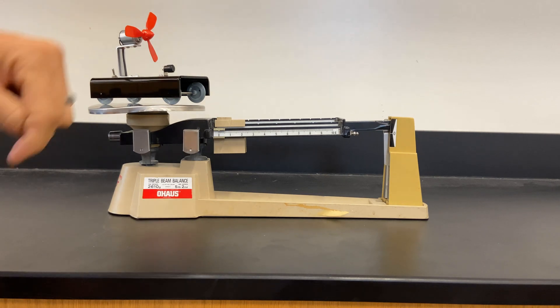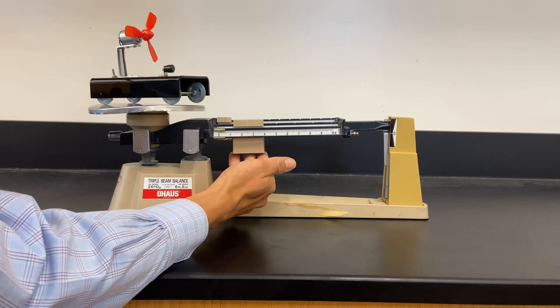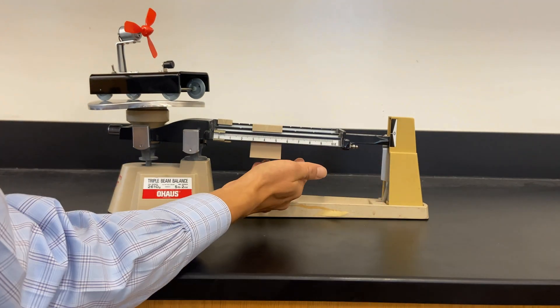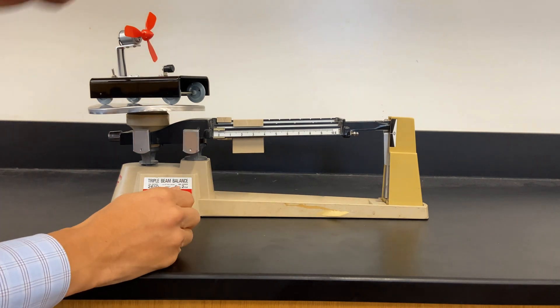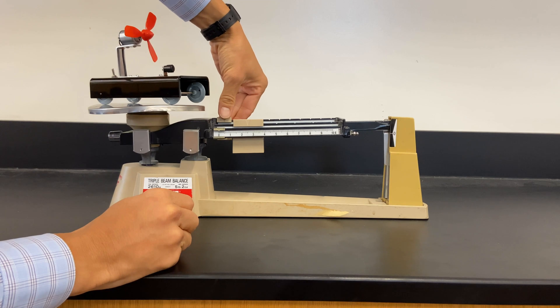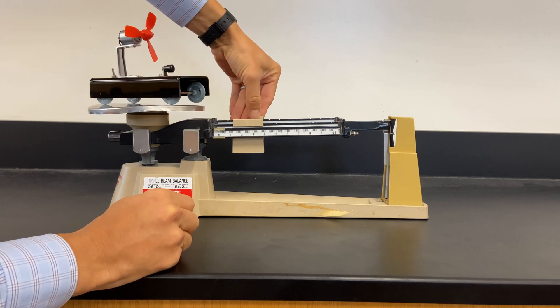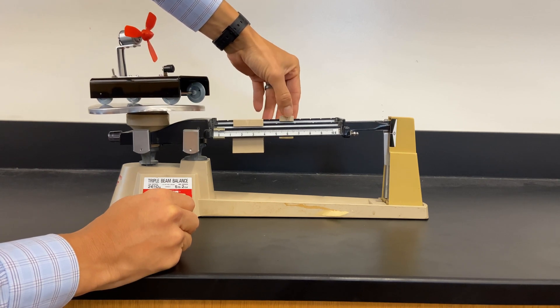You'll notice that there are three weights, and these are called riders. What we're going to do is move this to the right one notch at a time until the pointer goes down. Once it goes down, move that rider back one notch and then move to the next rider behind it. Then we're going to move it one notch at a time until that pointer goes down.